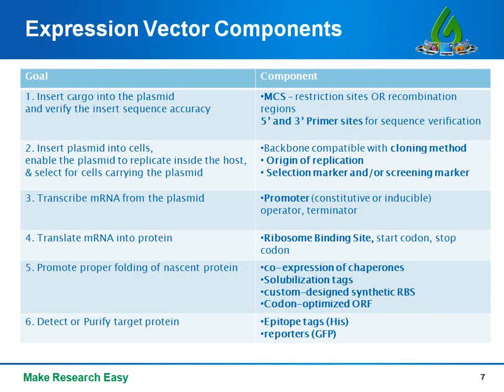And you need a way to identify cells carrying the plasmid so that you don't have a mixed pool of transformed and untransformed cells. This can be accomplished with a selection marker, such as antibiotic resistance, which will allow only the transformed cells to survive. Or you could use a screening marker that lets you visually see which cells are transformed and which aren't, for example, through blue-white screening.